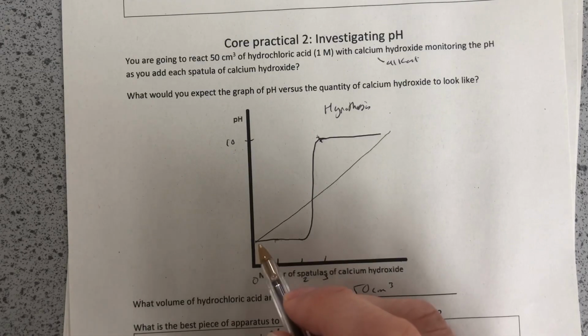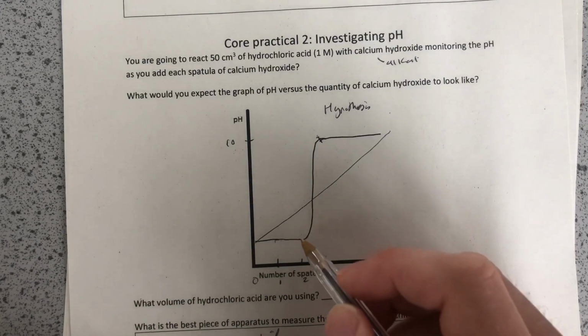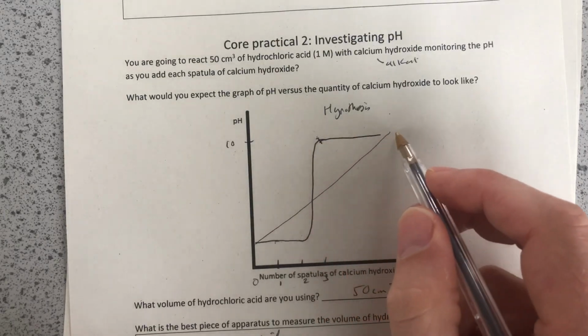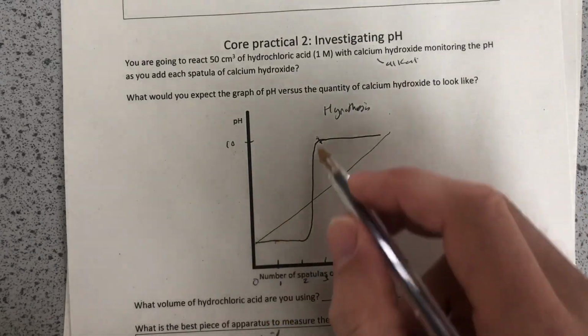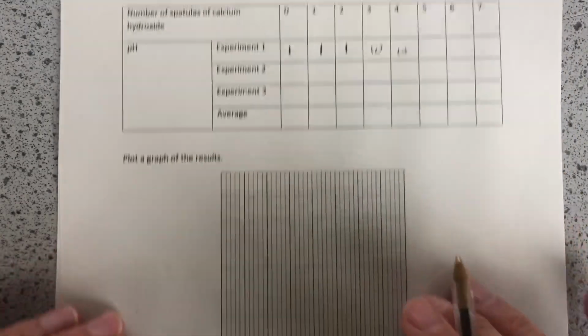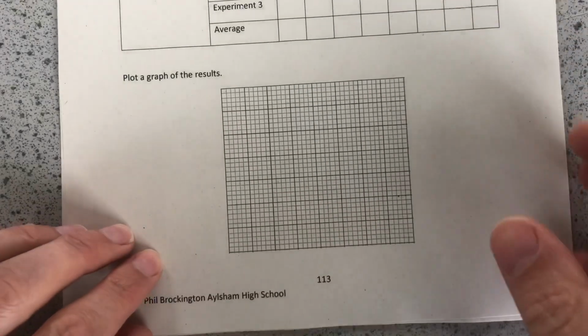With neutralisation, the pH stays acid until enough alkali has been added to fully neutralise the acid, the strong acid, and then the pH will suddenly jump as we add excess alkali. And so we get this S-shaped curve. We don't get a gradual rise, we get an S-shaped curve. You can plot that data on that graph paper there, and you will get a much more accurate graph than my sketch one.